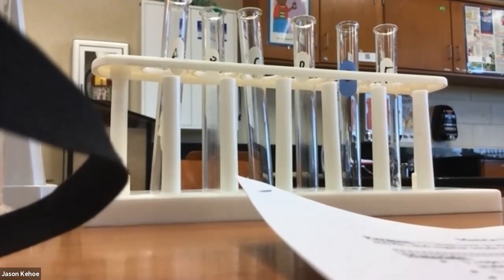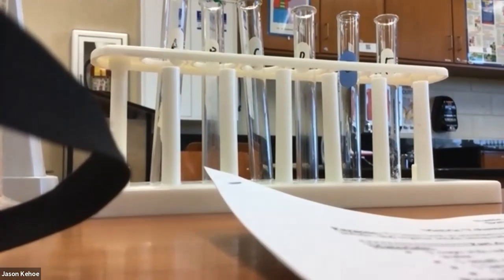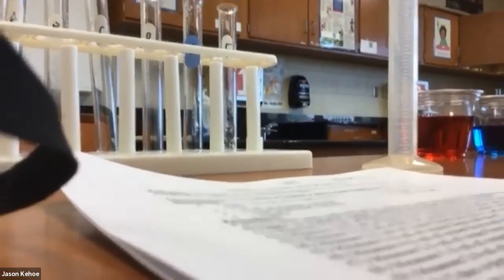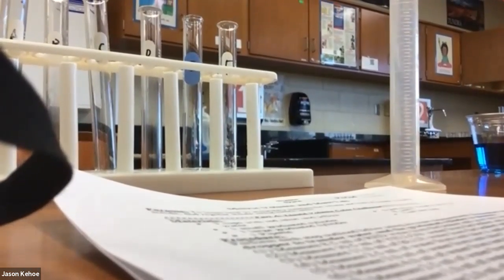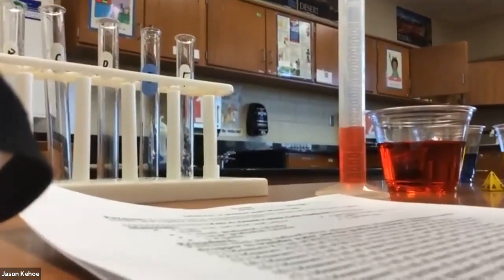Perform each step outlined below using accurate measurements. Remember to use the dropper or pipette to transfer water, and the graduated cylinder to measure. So the first step says to measure 8.5 milliliters of red water from the beaker, or in this case, I just used plastic cups for safety and cheapness, and put it into test tube A. Most people will be using a pipette to do this, but I'm just awesome, and I can pretty much eyeball it. I've had a lot of practice with this.